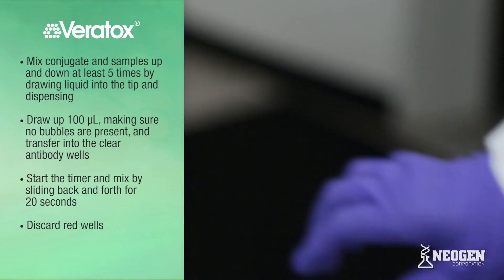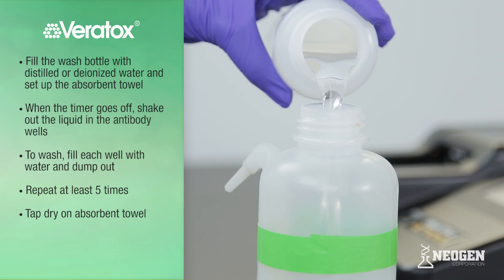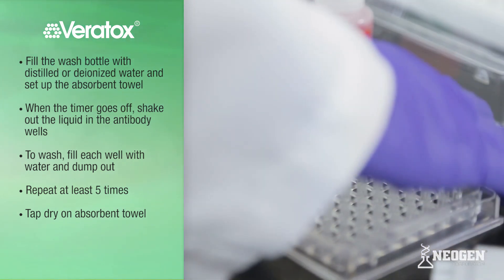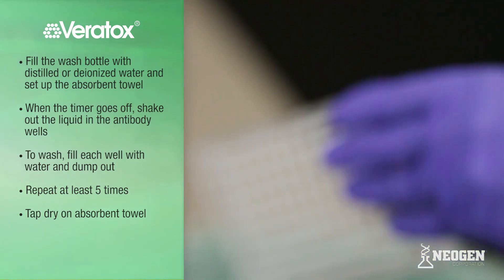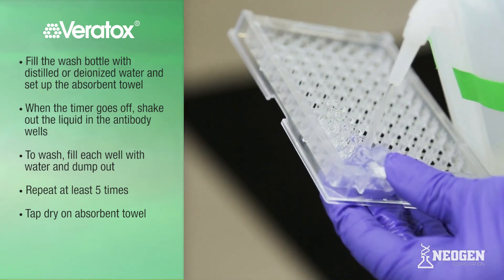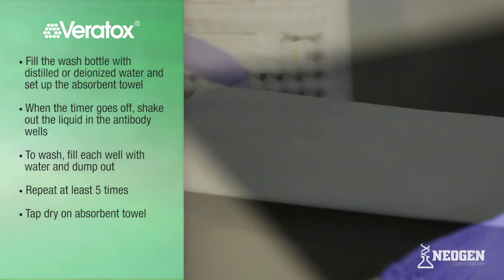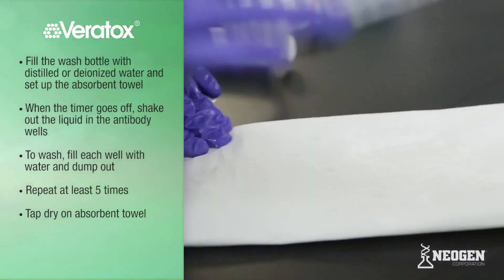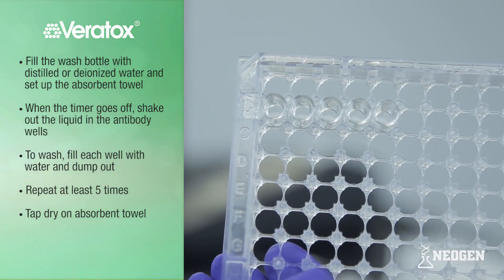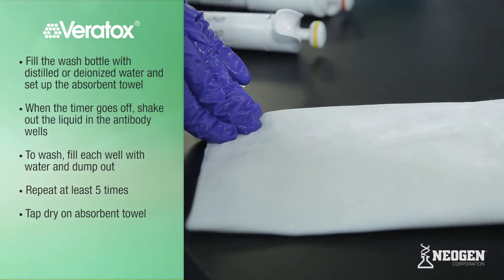Refer to the test kit insert for specific timing of other mycotoxin test kits. While incubating, fill the wash bottle with distilled or deionized water and set up the absorbent towel. When the timer goes off, shake out the liquid in the antibody wells. To wash, fill each well with water and dump them out — repeat at least 5 times. Turn the wells upside down and tap dry on an absorbent towel to remove excess water. Check for excess water or bubbles; if present, tap again to dry. Do not put anything into the well or blow air to dry — just tap.